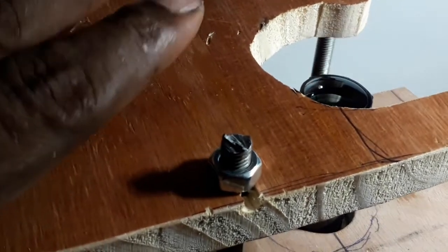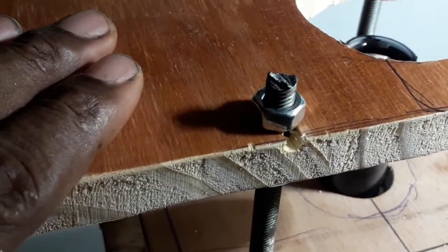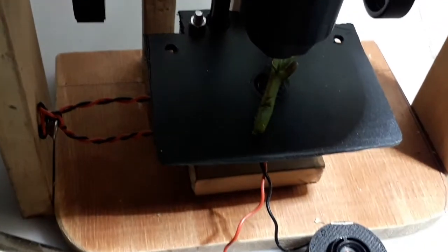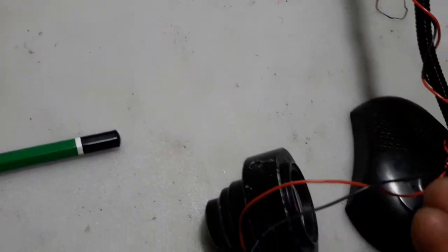So before, as I said, this is 3 pieces, but I can add different pieces. This last piece is made for smartphones. You can just rest the smartphone on there, adjust, find the position. But if you have other types of cameras, for example, let me see if I can find one so you can see these types of cameras. You can cut out a piece like this and then you can take shots of your work. Okay, you can document it.